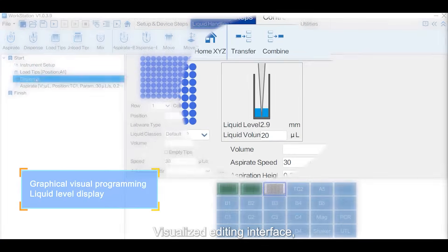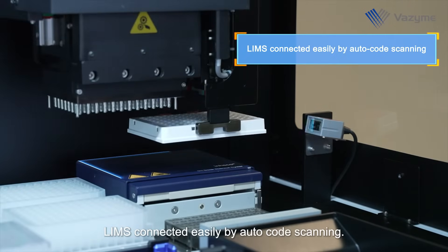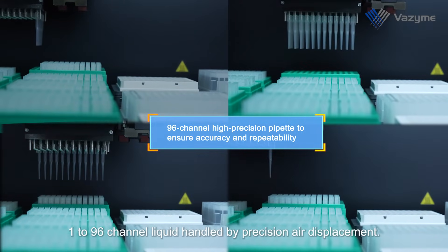Visualized editing interface. Easier program setting. LIMS connected easily by auto-code scanning. 1-96 channel liquid handled by precision air displacement.